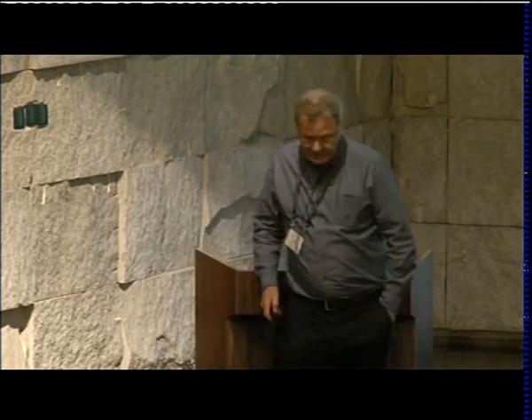The inside. Yeah, well, the picture might be misleading. We looked at it, of course, in the entire volume that was enclosed in the tomogram. In the end it was a two-dimensional picture, but we looked into the entire volume. And I should say, these studies were designed to look at the aggregates and not at the 26S.